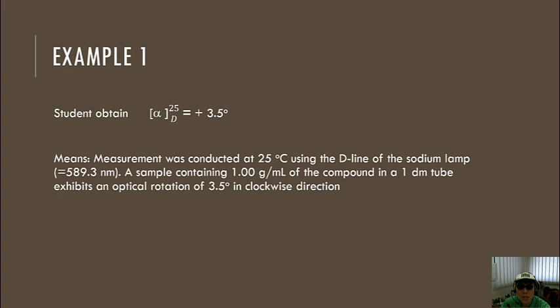Note that the instrument used in CM3291 can provide the specific optical rotation, which already corrects the optical rotation for the cell dimension and the concentration. But the optical rotation data is raw. It's raw data which does not include these corrections. So it is very important to pay attention to which mode was used to acquire the data. Okay?